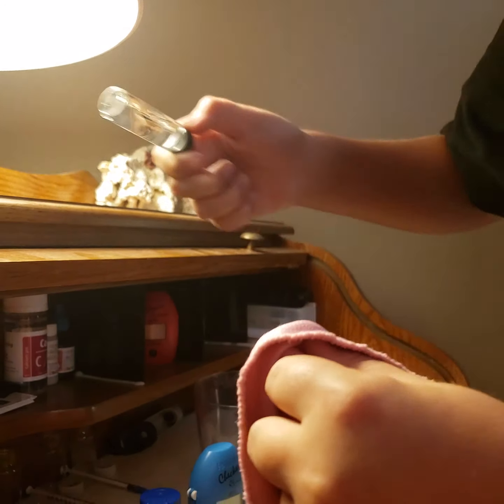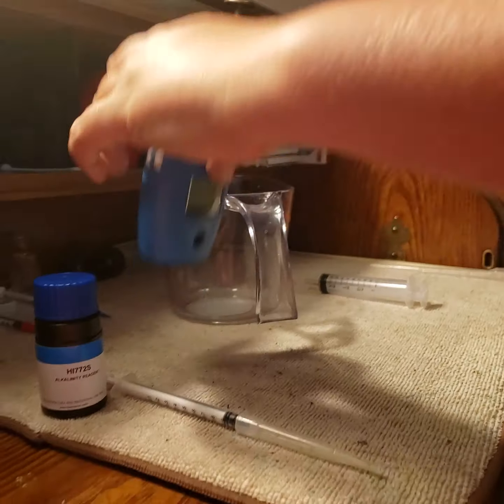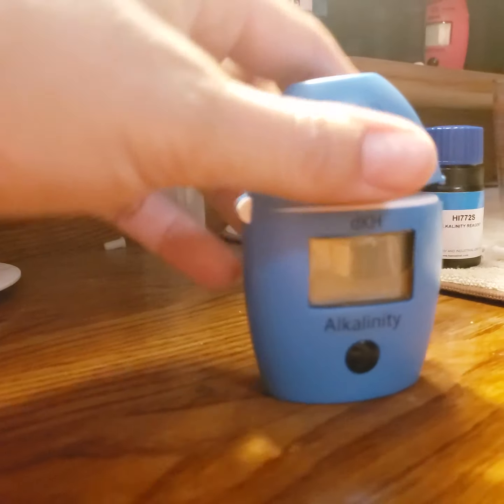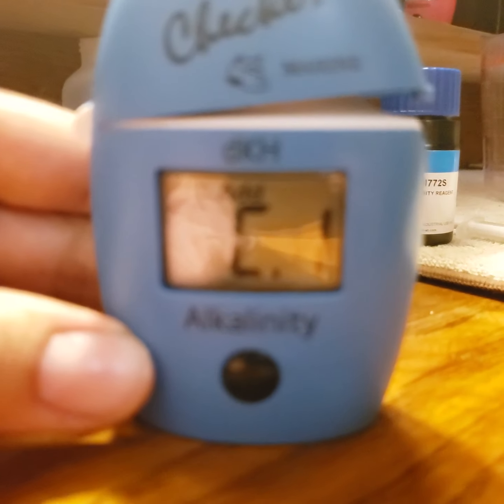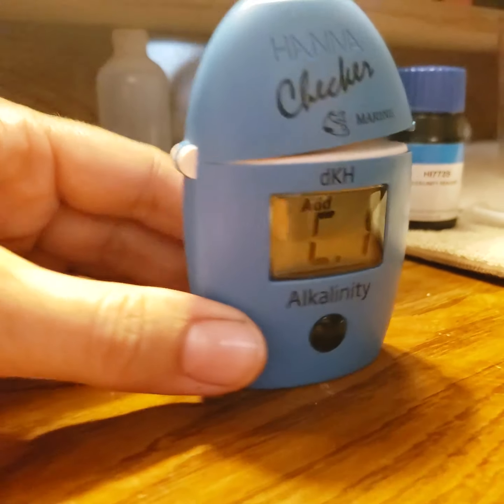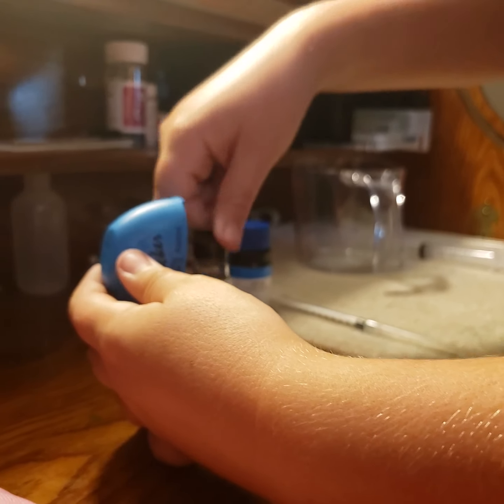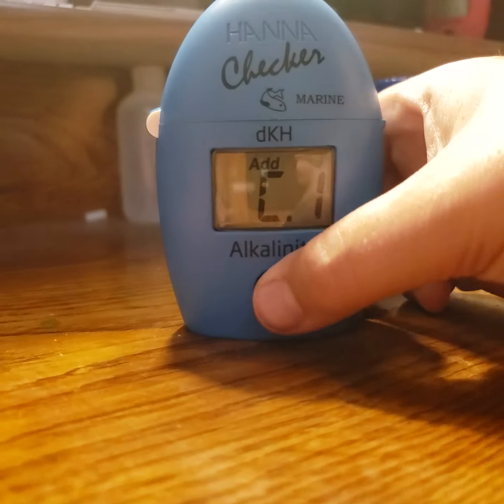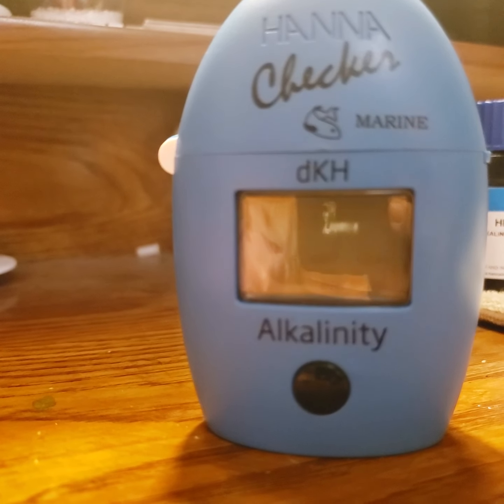From now on, he's gonna hold it by the lid. He checks, making sure that there are no fingerprints. Next, he's going to add it to this checker. First, we turn it on, and as soon as it shows that it's ready, like this, he can add the container. Once he adds the container, he closes it and presses the button again, and you have to wait until it tells you to add the second container.